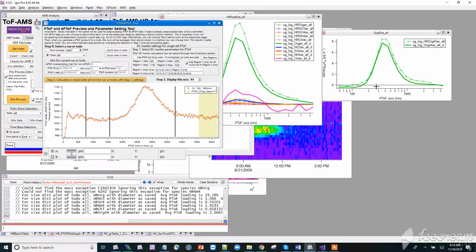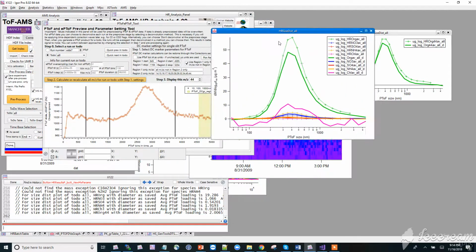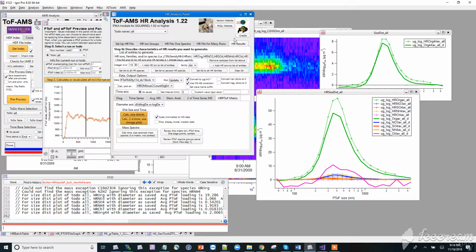So when I normalize it, my unit mass resolution is going to be smaller because of these negative values through here. So what I'm trying to tell you is that if you're subtracting the DC1 region, like I did through here, it makes sense that my high resolution is going to be higher, in this case for CO2, and then for some other values as well, having to do with air.